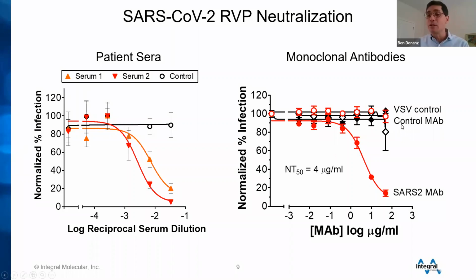That antibody binds the receptor binding domain of SARS-1, whereas this SARS-2 antibody that neutralizes binds the receptor binding domain of SARS-2. And that's important, of course, because when you start getting into epitope mapping and differentiating how antibodies are neutralizing and what the best correlate of protection is, these kinds of differences matter. They both bind a highly important region of the virus, the receptor binding domain, but they have different effects. One neutralizes and one doesn't. And I should say this control antibody actually binds extremely well. It just doesn't neutralize. So there are important differences in epitopes that are important to recapitulate in reporter viruses so that you're getting the most accurate results. And that's important in some of our other studies that I'll show you.